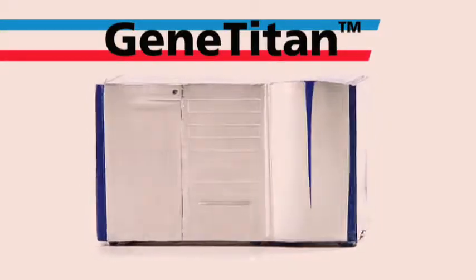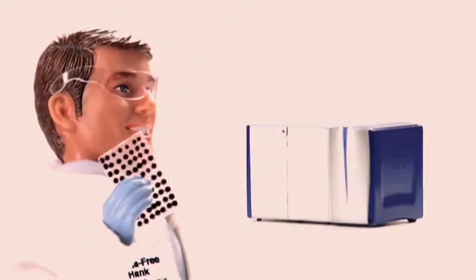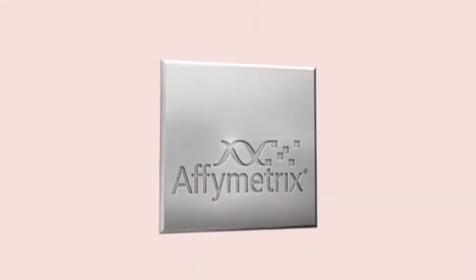Gene Titan system comes equipped with the GeneChip Command Console software. Hands-free Hank, Janome Jane, P.I. Pedro — array plates and assays sold separately. From Affymetrix.